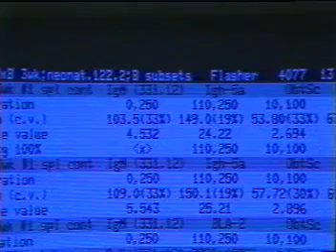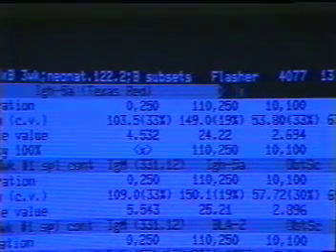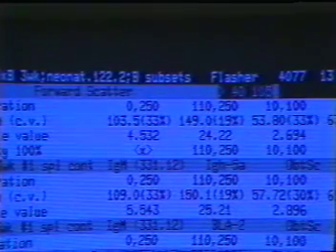To request a Texas Red histogram, we enter gates for fluorescein, press Return to accept the X-axis default for Texas Red, and then enter gates for the remaining sensors. Pressing Return after the final sensor prompt automatically accepts defaults for all optional prompts, thus yielding a 100% density histogram.